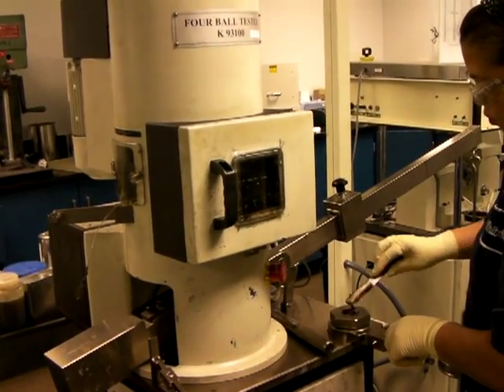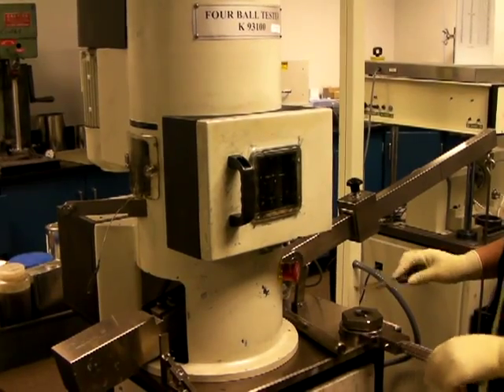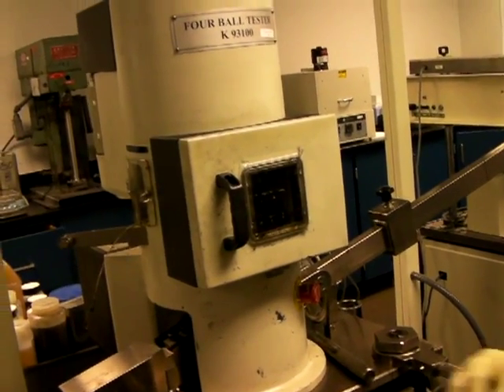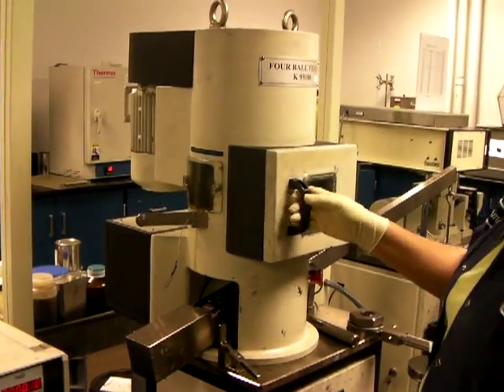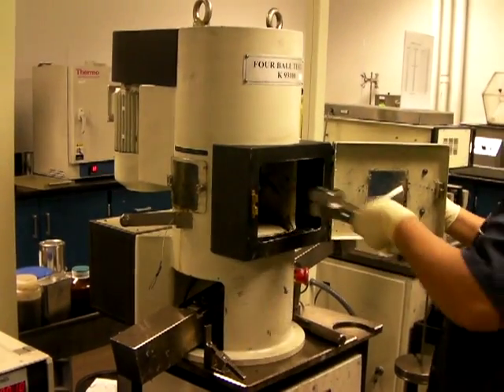I've got a question for you, Carmen. When we run it at 800, does it actually weld or not? It does. So this should pass. And the test is run for 10 seconds. Yes. So if you don't get a weld in 10 seconds, then you've passed that stage.